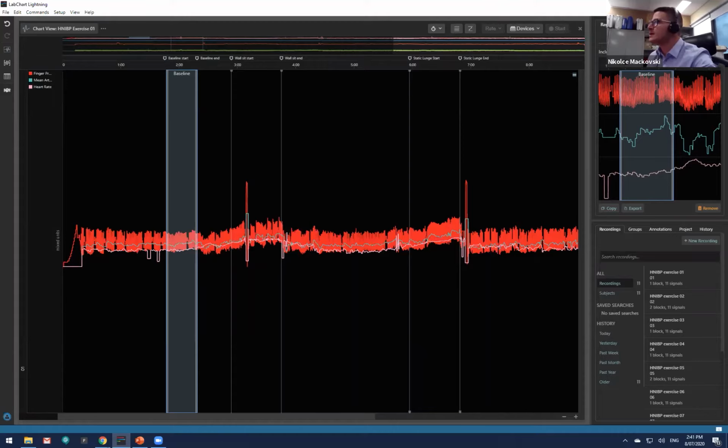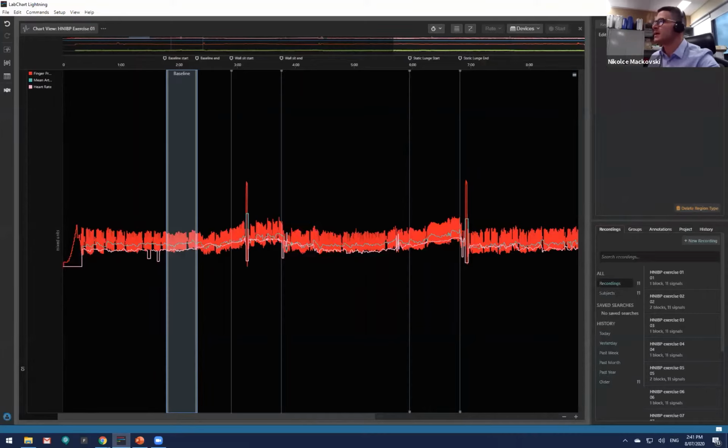And if you notice here, there are these dots. Like I said in another webinar, anytime you do see these three dots, that leads to something else. So it leads to some properties. So let's just investigate what these properties are. So in this case, if I choose on these, it shows edit baseline. So with this, I can, of course, change the baseline. I also have the option to change the color.